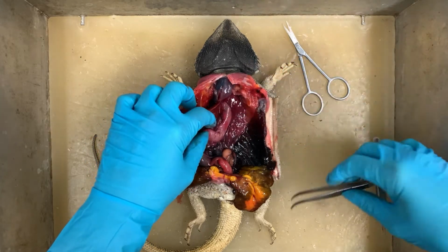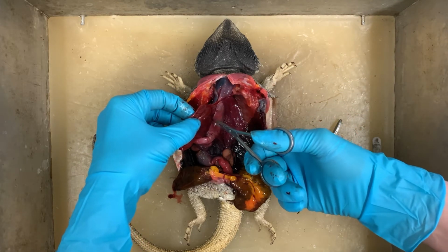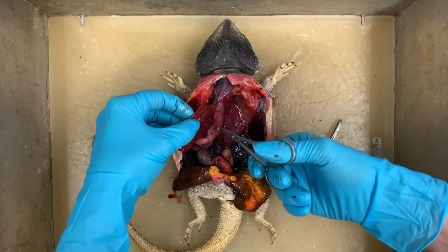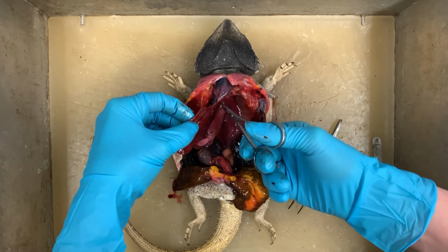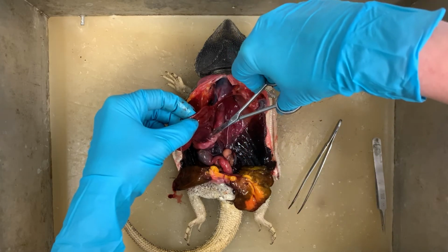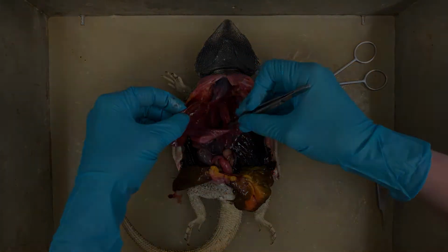To better examine individual organ systems, we must free them. First, we separate the mesenteric membranes that connect the intestines and other organs using a combination of scissors, tweezers, and a probe. We can then extend the organ systems to the side of the specimen to see the full system.